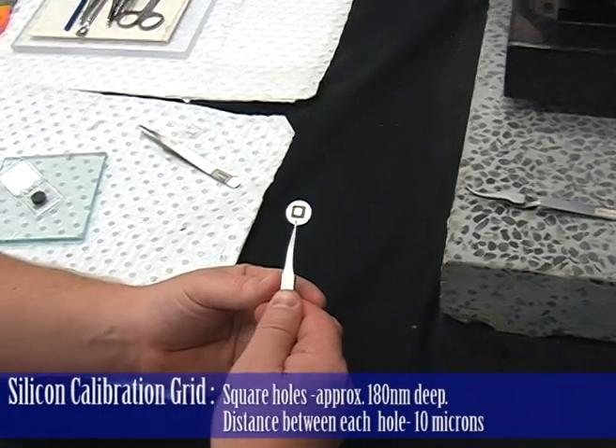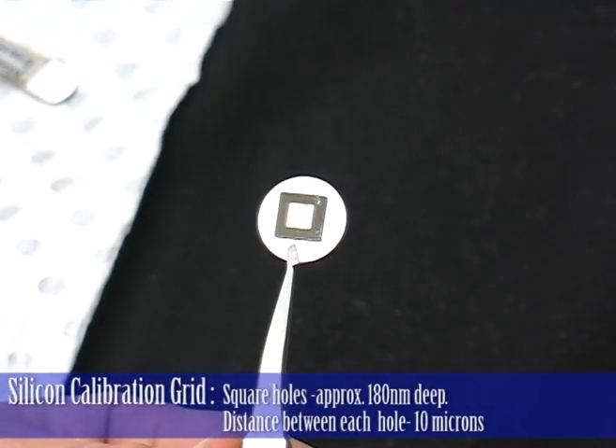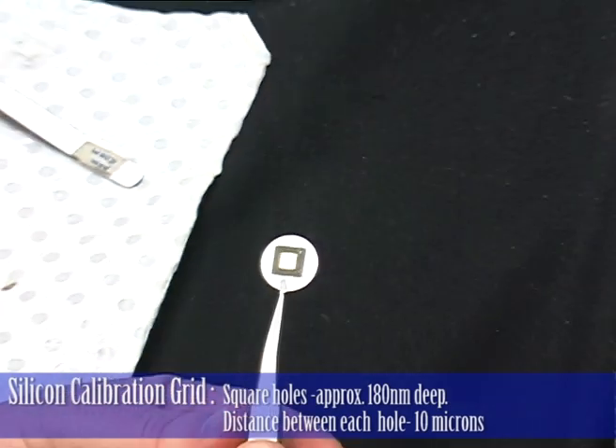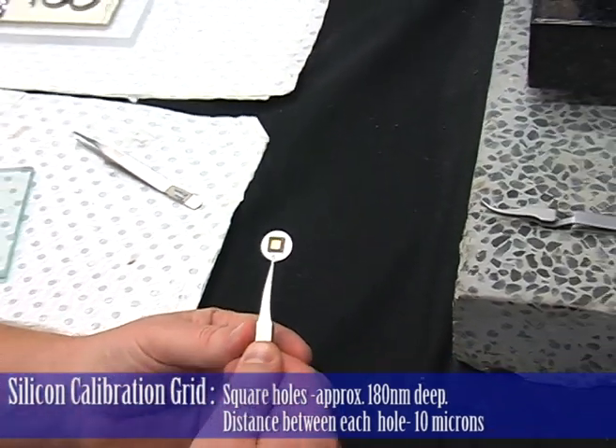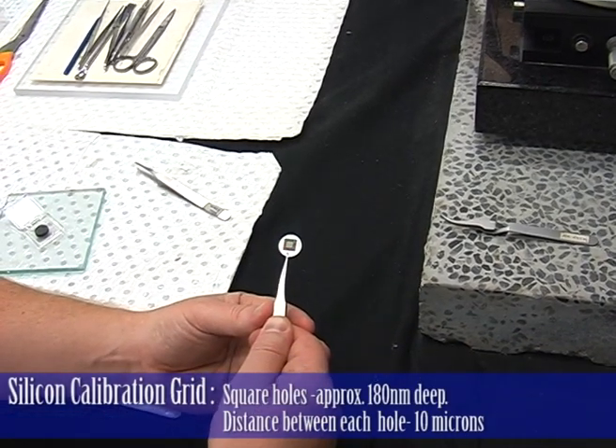This is our sample. It's a silicon calibration grid. It has square holes in the surface that are approximately 180 nanometers deep. And the pitch, or the distance between the edge of each hole, is about 10 microns.